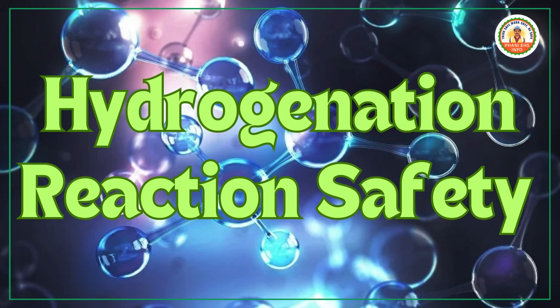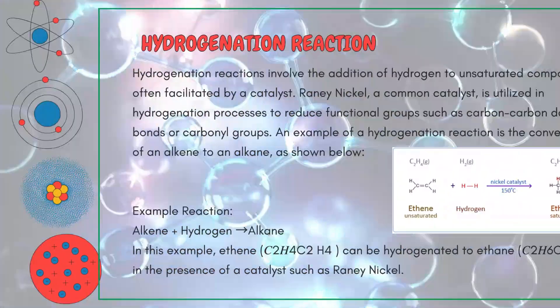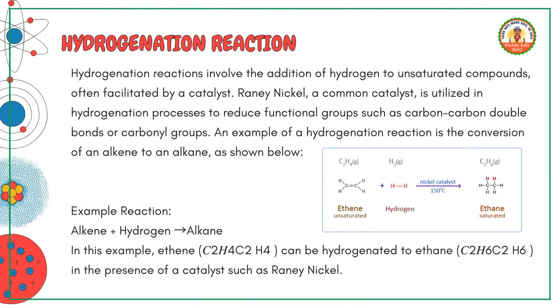Today, we'll be discussing the safety protocols for hydrogenation reactions. Hydrogenation reactions involve the addition of hydrogen to unsaturated compounds, often facilitated by a catalyst. A common catalyst used in these reactions is Raney-nickel, which helps in reducing functional groups such as carbon-carbon double bonds or carbonyl groups. An example of a hydrogenation reaction is the conversion of an alkene to an alkane, as shown below.